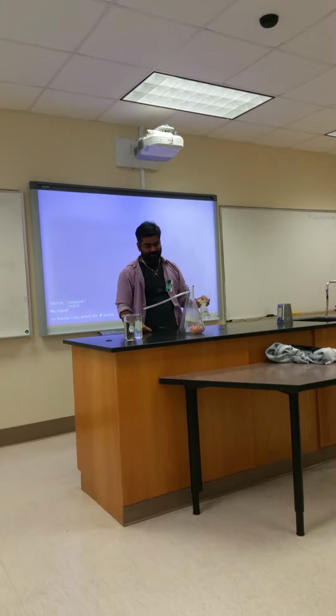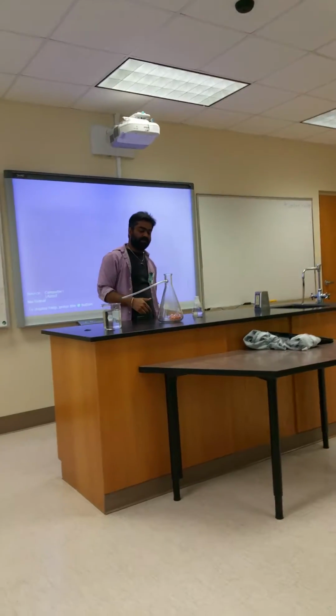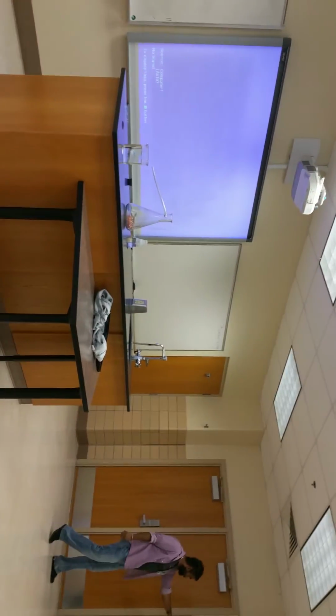A reaction that you won't be able to do at home. And you said that's nitric acid. Hydrochloric acid, but it's going to give you copper chloride, which is not going to be that beautiful blue. I'm going to cut off these lights so you can see the blue beautifully.